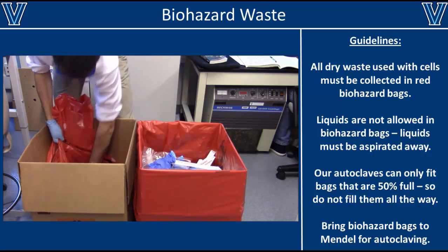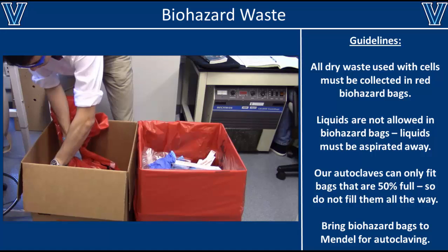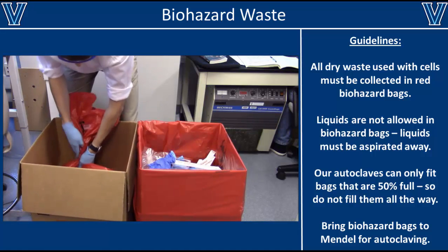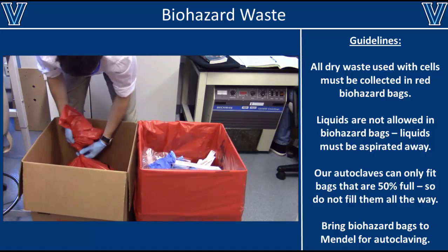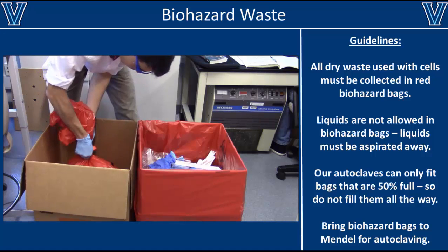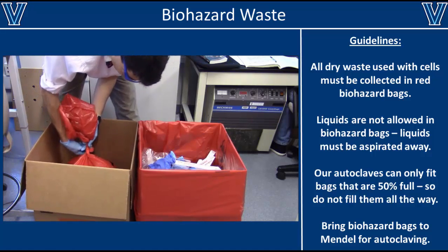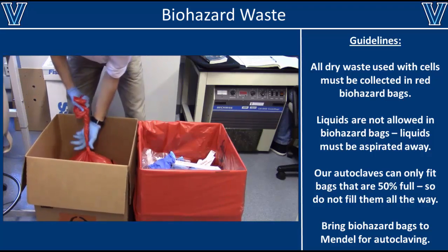Once your bags are ready, carefully detach them from the brown cardboard box and evacuate as much of the air from the bag as possible. Do both of these steps very carefully and slowly, since it is possible to tear these bags. Once you've gotten as much of the air out of the bag as possible, twist off the excess plastic and secure it with a piece of tape.